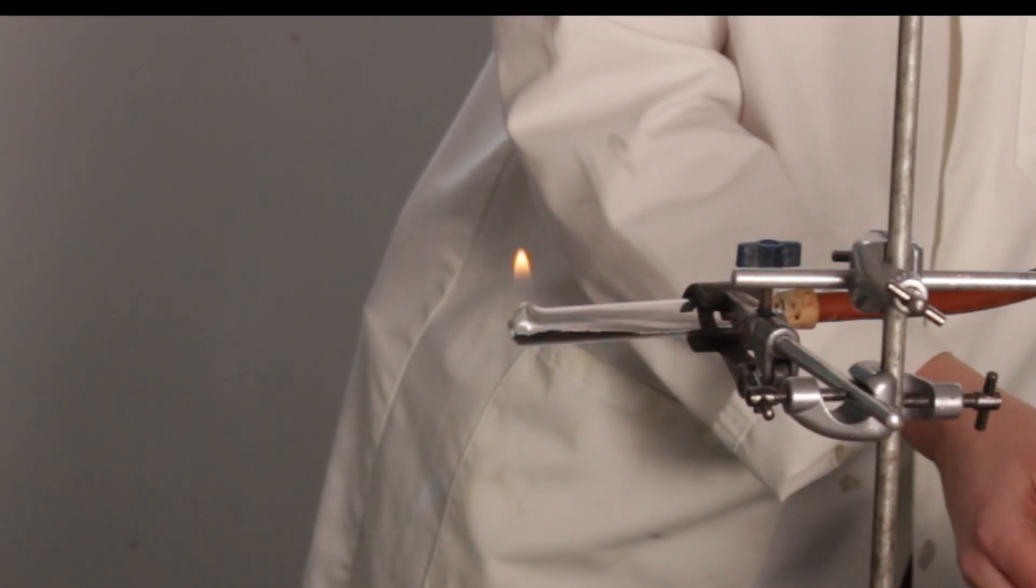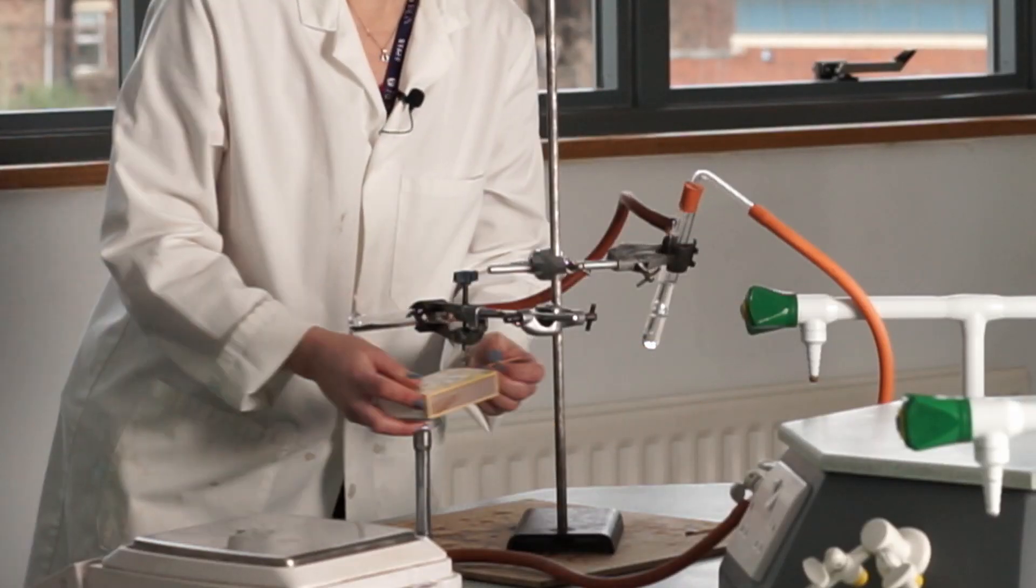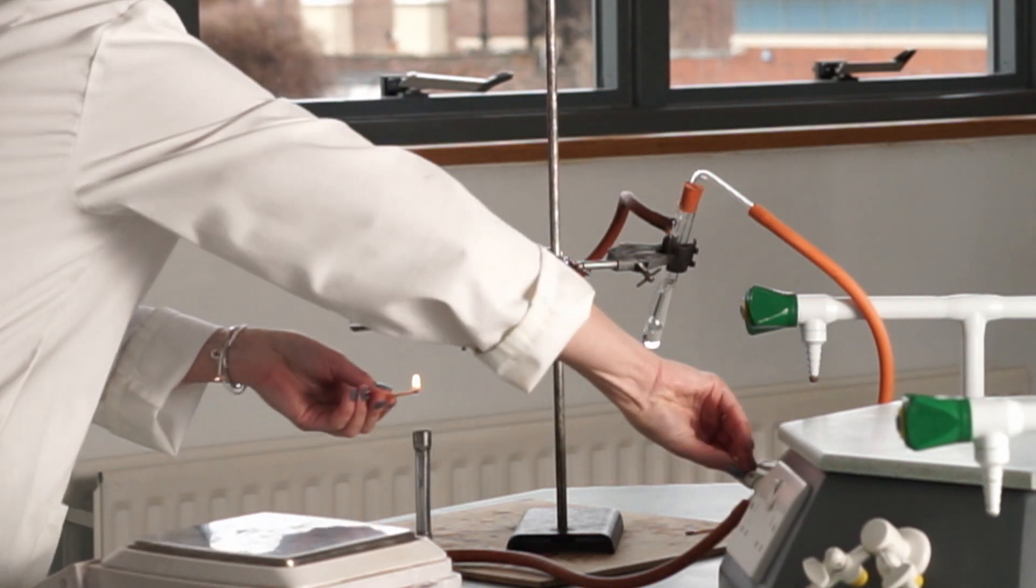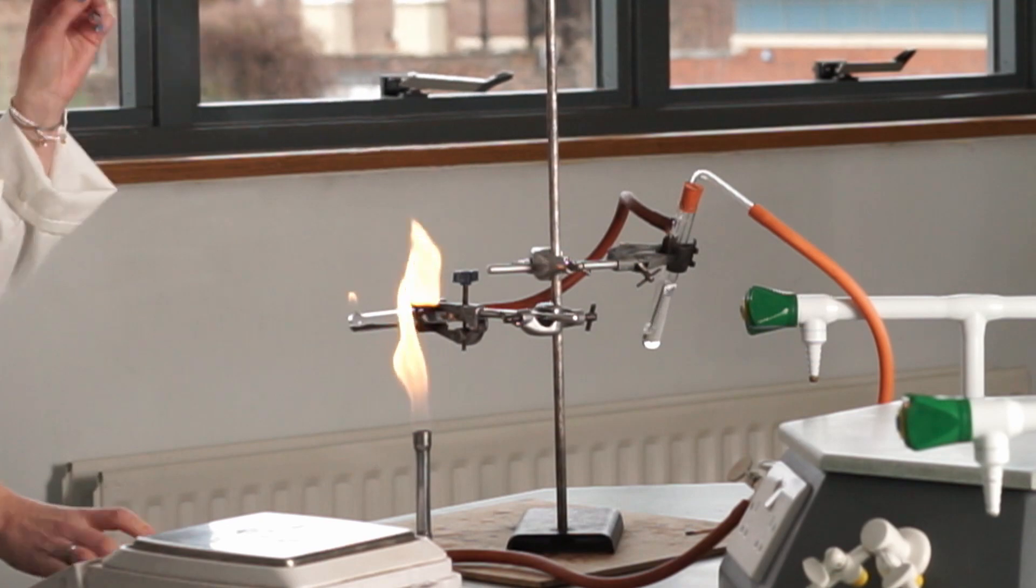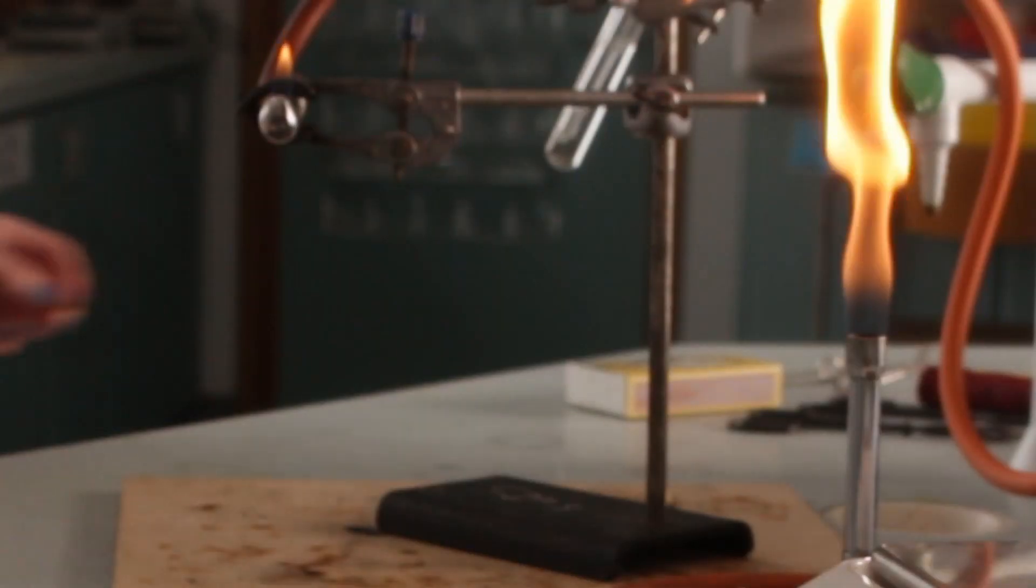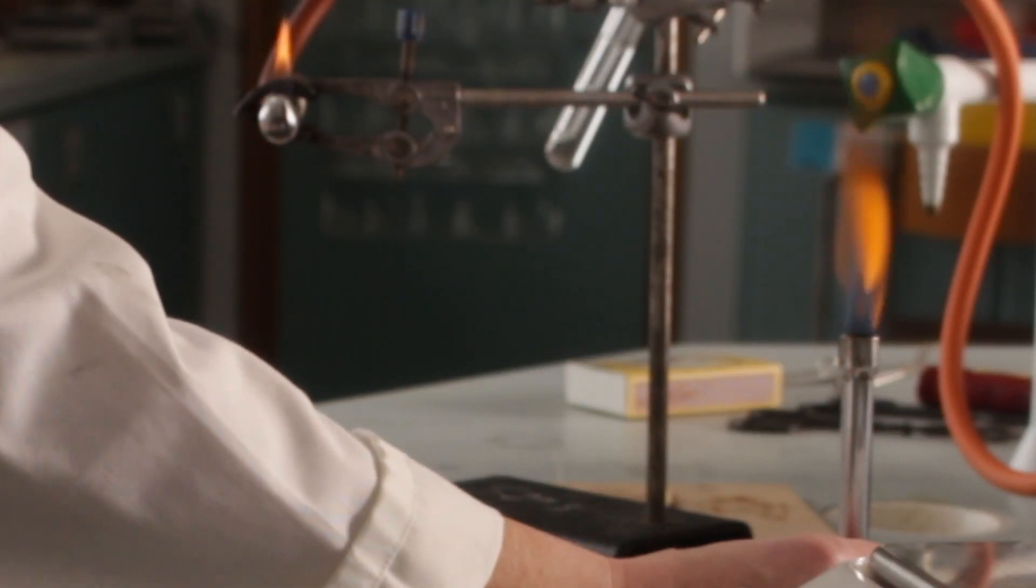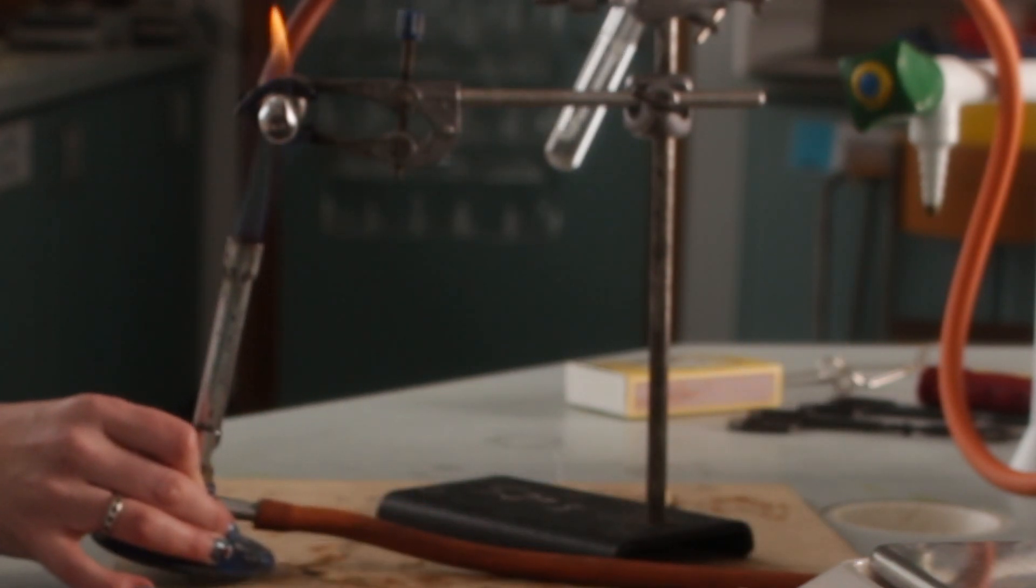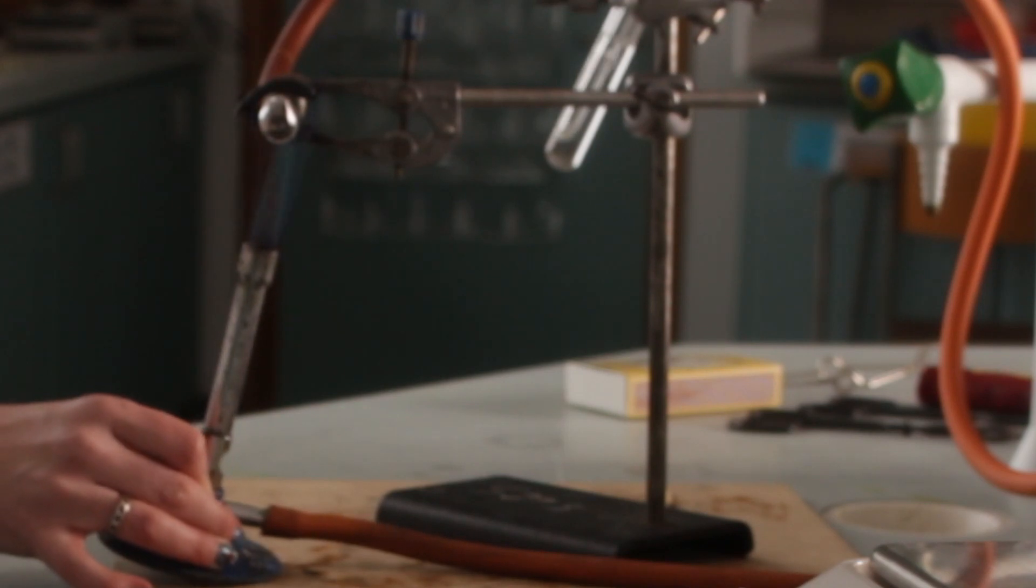So I've got the methane coming through that system. Now I'm going to light my Bunsen burner. And I'm going to use this to strongly heat the copper oxide.